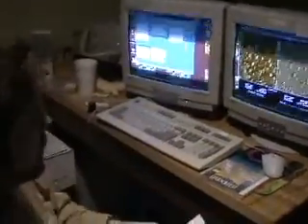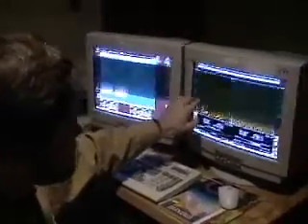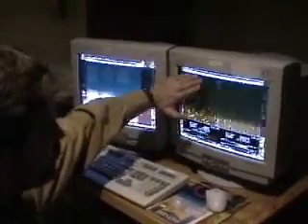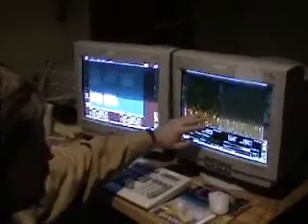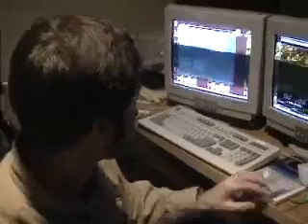Most of the time, this gives you a very meaningful display, and in fact it's the best way to look at your data. But it does happen occasionally that, let's say, I have a step in my sample where perhaps this bottom part of the sample is high and the top part of the sample is low. Because I'm doing this line by line, quote, plane fit, unquote, it's going to subtract out that average height difference, and that step will be completely suppressed on the image that's displayed, although it would be present in the data that is saved to the disk.